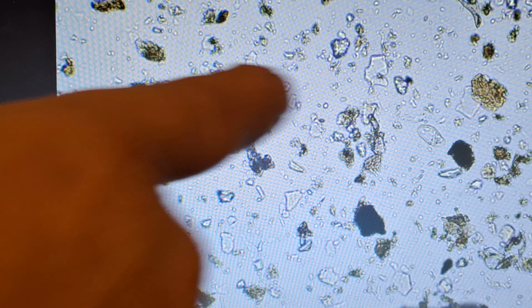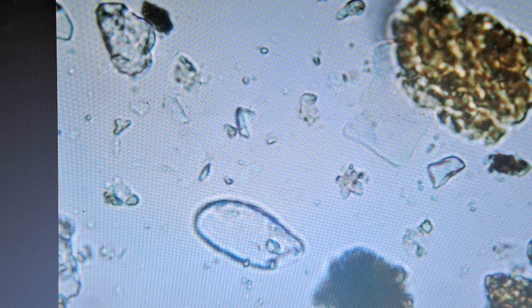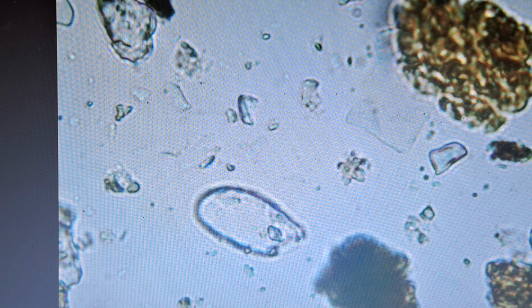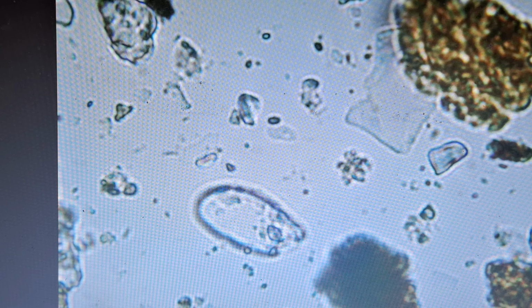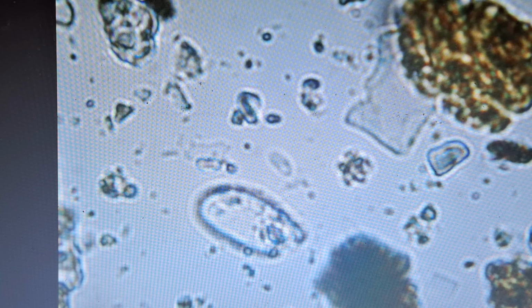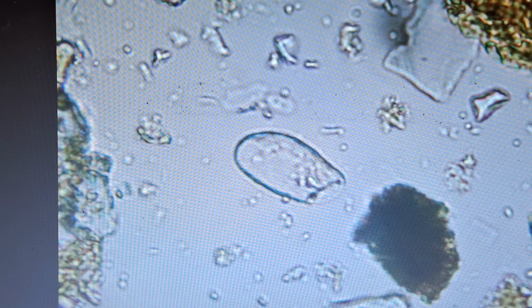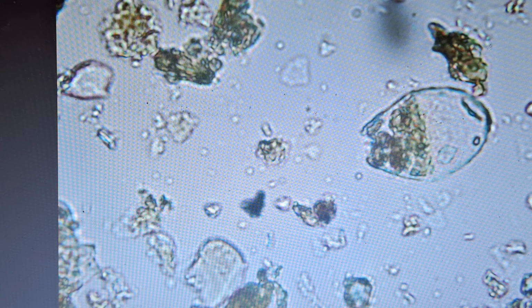I'm going to go in a little closer. We can see it there, I believe, right next to it. We'll center that. Go in a little closer. Oh, there's movement. And so that's the testate amoeba, at least one flagellate, maybe two next to them. Flagellate just means there's a flagellum, one long tail-like thing, usually just one. I believe that's what it is, the way it's moving. We have that other testate amoeba over here, right there. It's a good looking one.